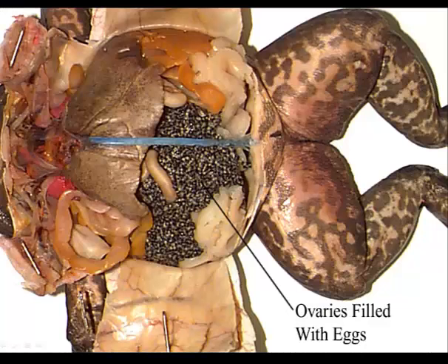When you open up the body cavity, if you have a female, the first thing you'll notice is all of the eggs. You may need to remove some of those ovaries and eggs in order to see other structures.